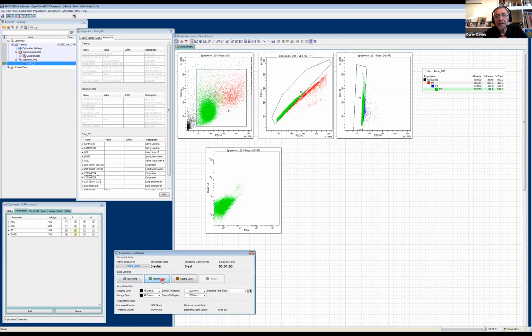So while Kathy's doing that, I'd say the doublet gates that we put on there, how many you use may depend on the question that you're asking. The rarer the event that you're looking for, the more doublet gating I would do, because I want to be sure in my final analysis that if I see a dot that's double positive, it is a single cell that's double positive. If I'm just screening transfectants, for example, I may just use one gate, but for most experiments we'd use two.